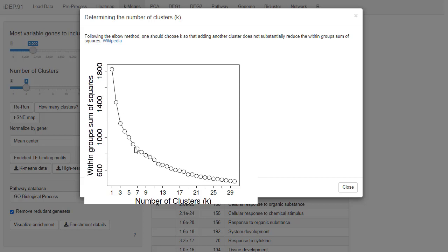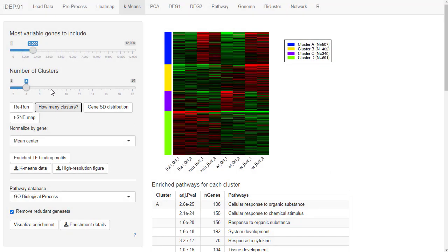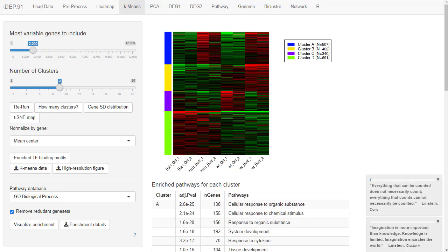But when it comes to here, this region is pretty murky. It's very subjective, and it all depends on how granular you want the data set to be, and further discussions. In this case, we settled on 9. It's very arbitrary, actually. So we're going to change this to 9 clusters.